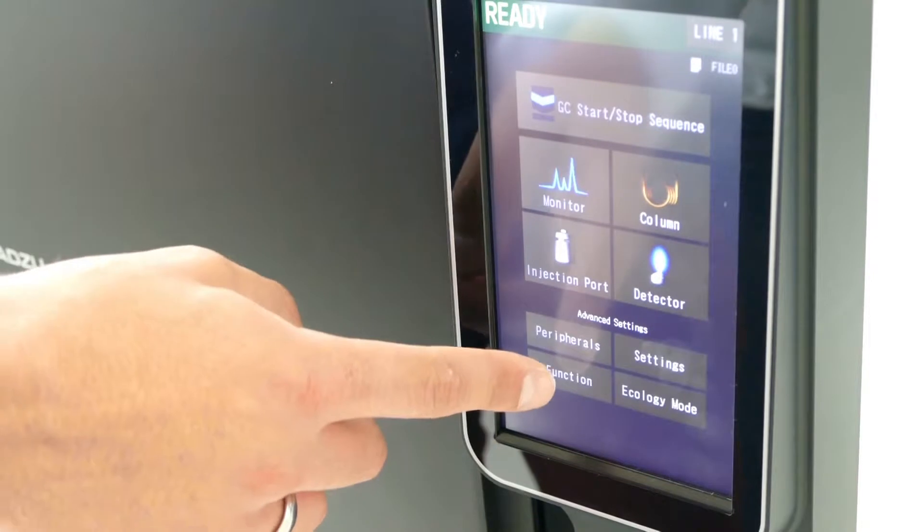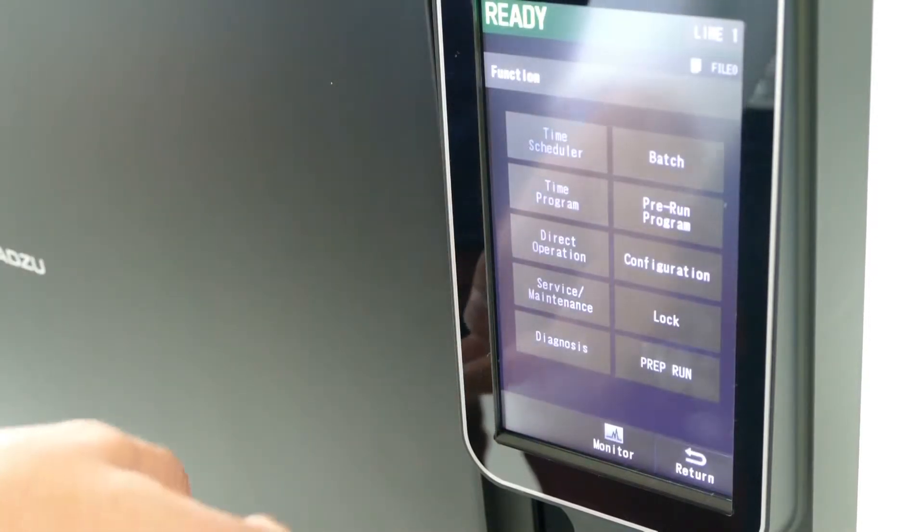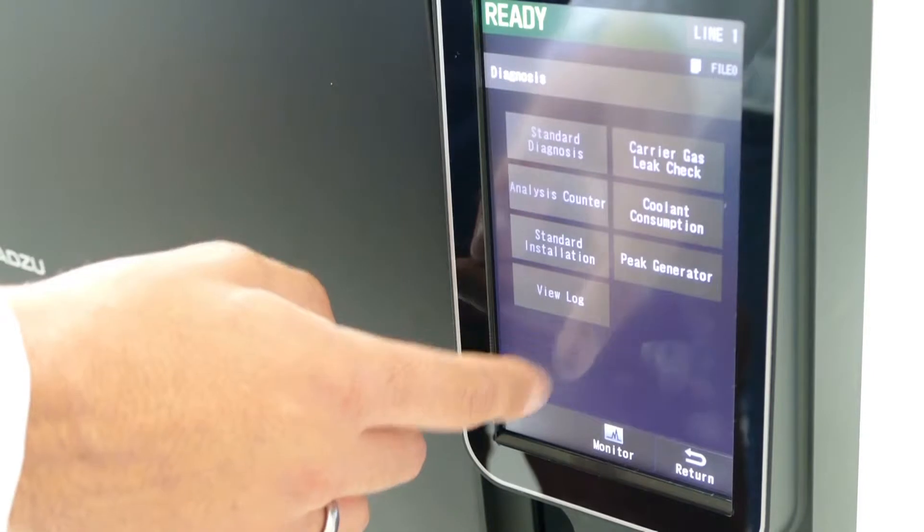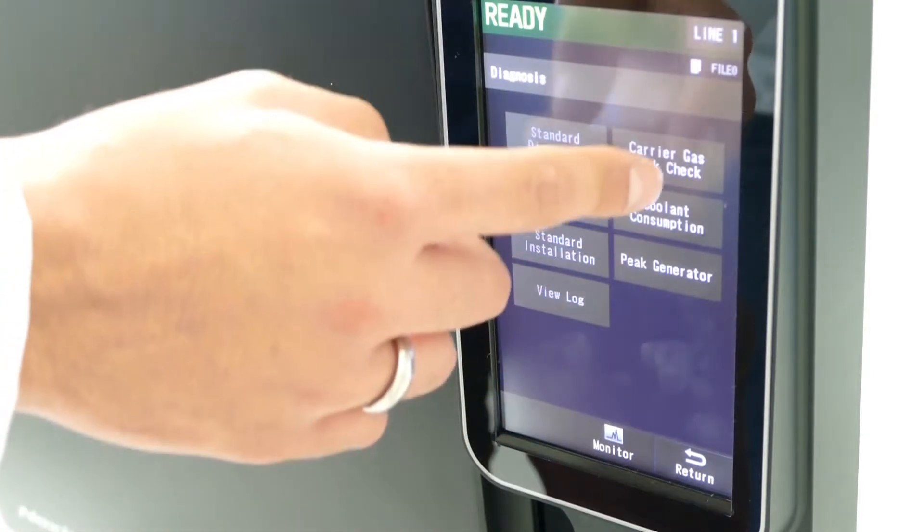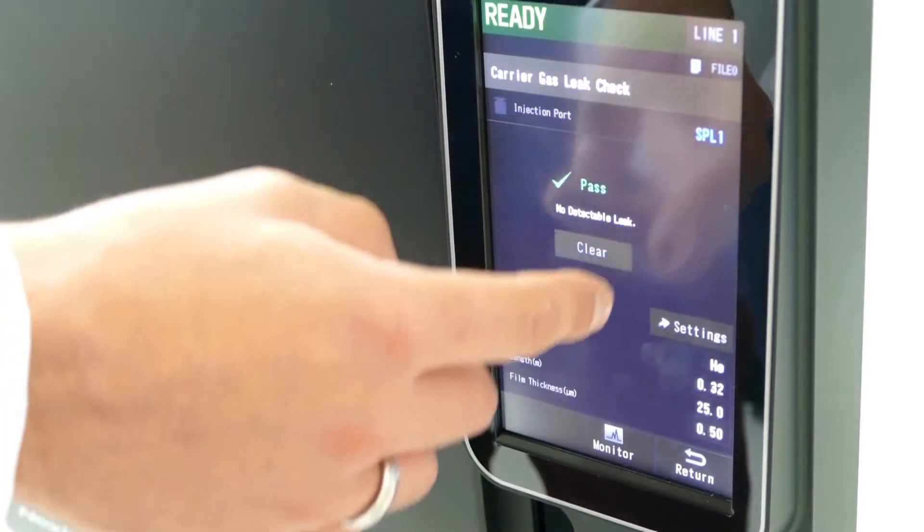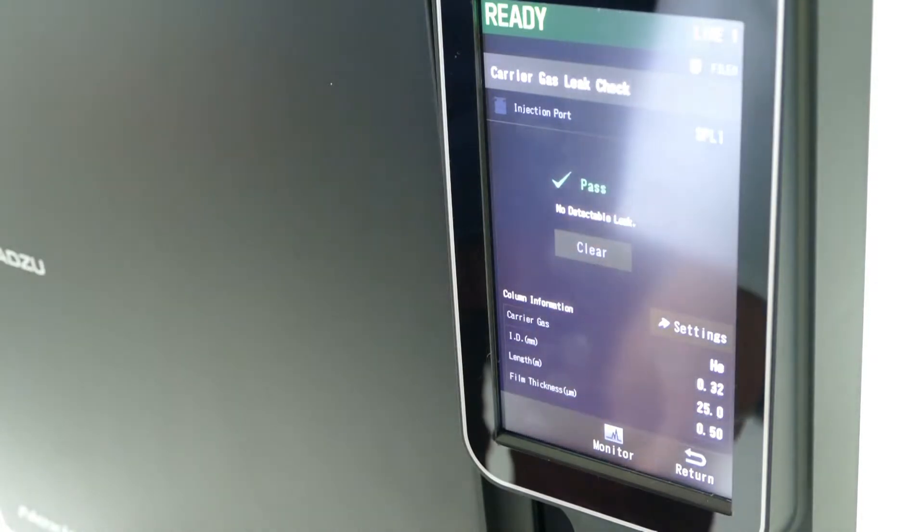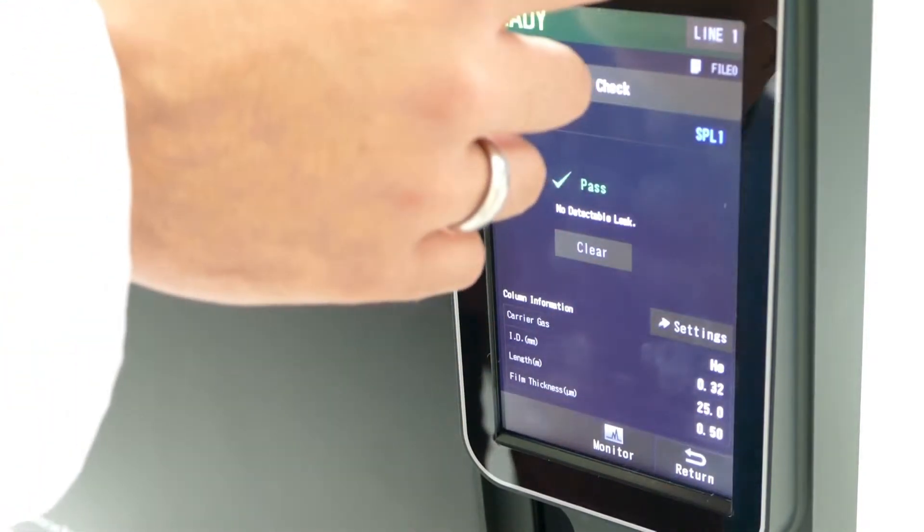It's possible, for example, to perform an automatic system check to ensure your GC system is leak-tight. To do this, navigate to the diagnosis menu and activate the carrier gas leak check. The GC will then report if the system is leak-tight or will advise of a leak.